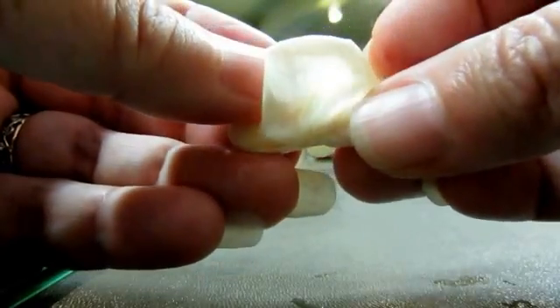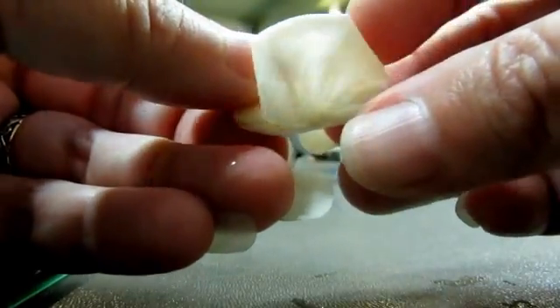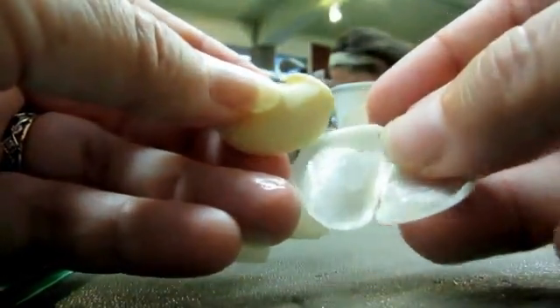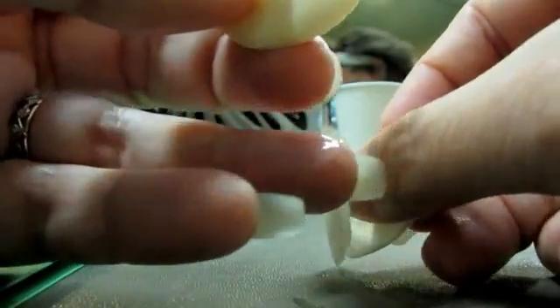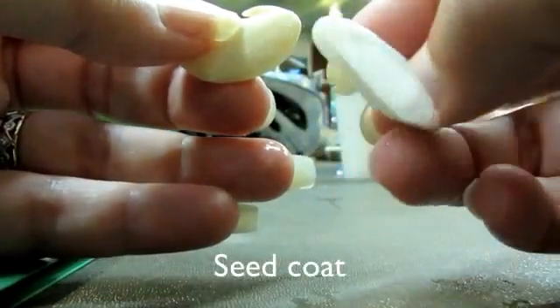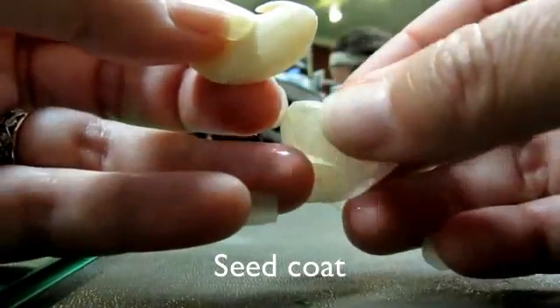So if you manage to tape it apart carefully, you can get that little coat right off. And this is what is technically and botanically known as a seed coat. I love it when the mechanical term is very straightforward. So here we've got a little coat.